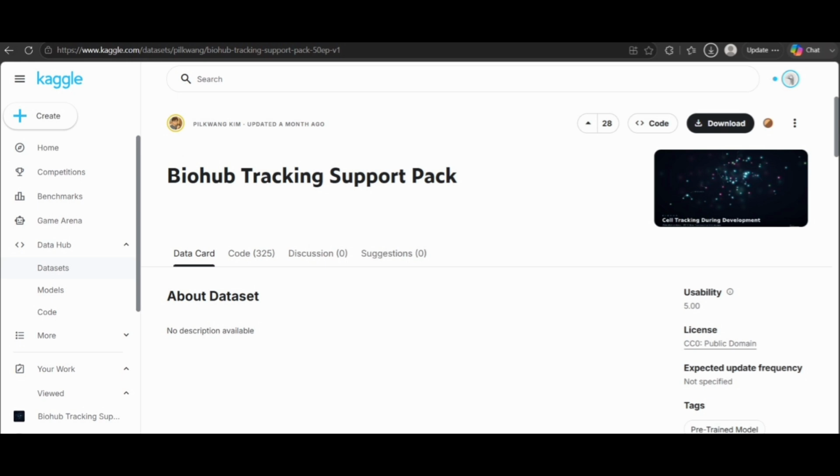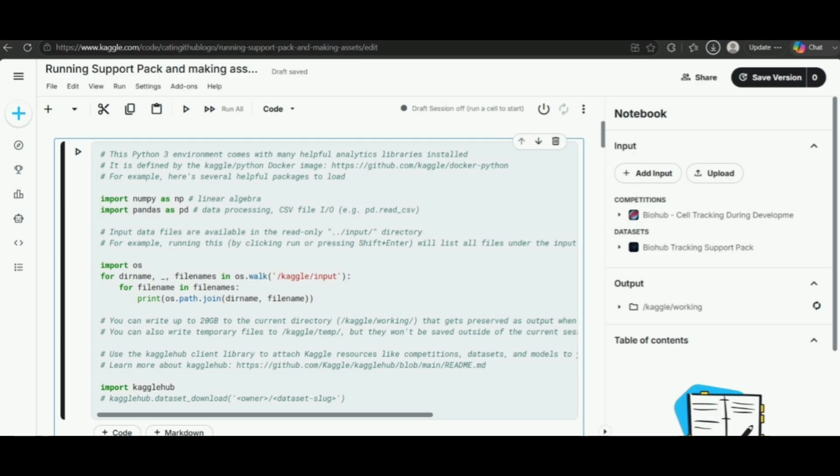I highly encourage all of you to read their repository and try to understand the code if you're interested in implementing this entire pipeline. And if you just want to implement a very dryish run of the pipeline, or if more aptly you like the visuals in this video, feel free to check out my notebook, which just allows you to download those visuals on your own local system.